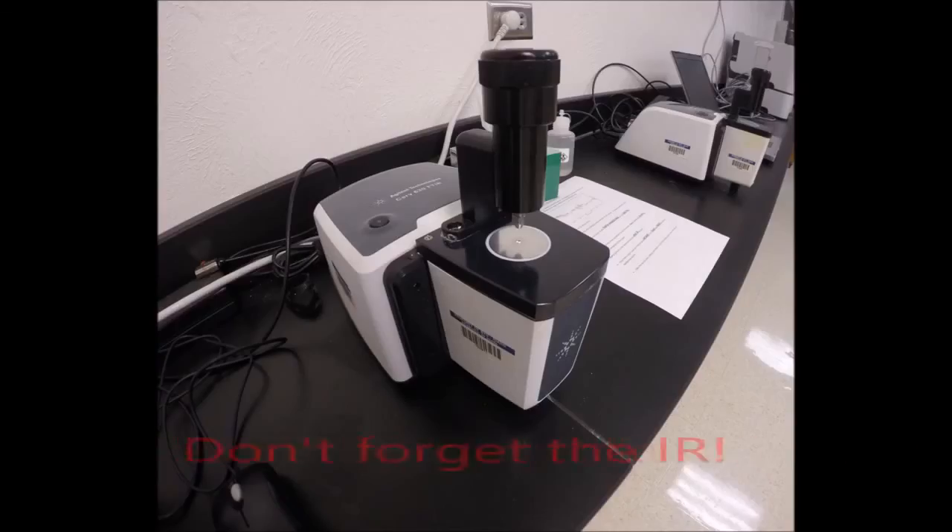Either before or after using the refractometer, make sure you get an IR spectrum of both your hexane and toluene samples. Gathering multiple forms of data allows you to be more confident that your product is pure. If you forgot how to take an IR, the instructions are right next to the machine.